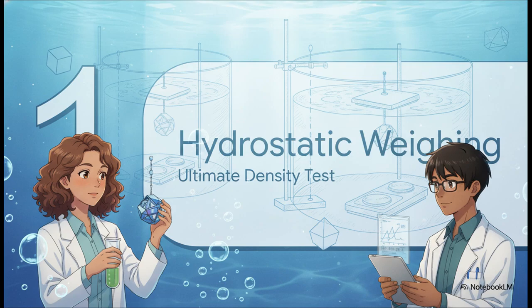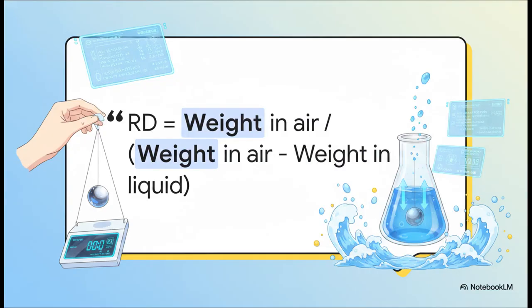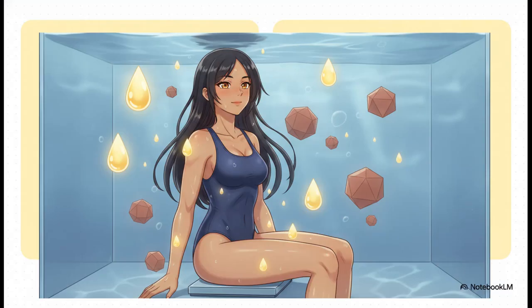Section 1. Hydrostatic weighing, the ultimate density test. So how do we push this even further? By comparing the normal weight of an object in the air against its apparent reduced weight when it's fully submerged in liquid, we can calculate its precise relative density. The liquid literally pushes back with a buoyant force, and measuring that specific difference reveals exactly how much volume the object is displacing.